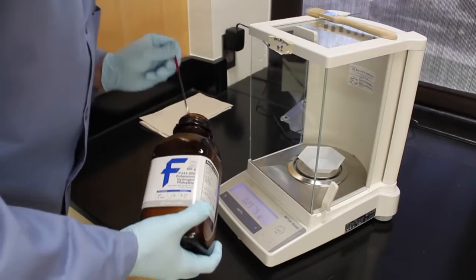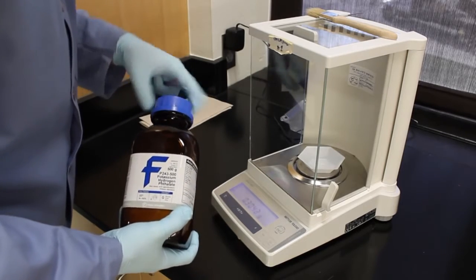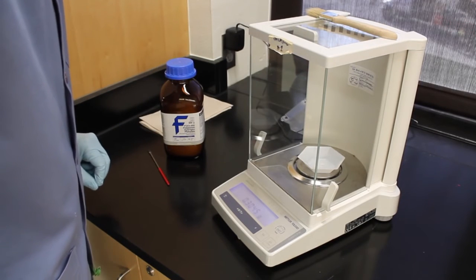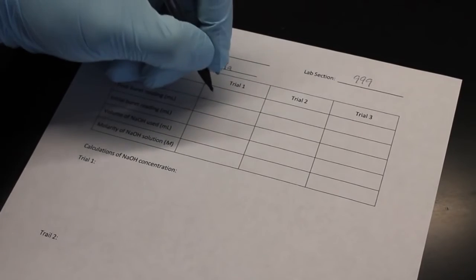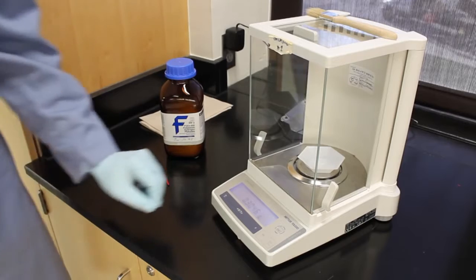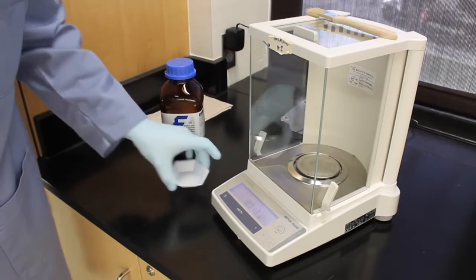Any excess KHP should not be put back into the bottle, but disposed of properly. Ask your TA for specific instructions. If you are using this style of balance, make sure to slide the door closed to get your final mass. You will need to document your KHP masses each time you take one. I recommend you weigh out 4 separate boats of KHP for your titrations, but really it's up to you how many you do. Make sure the balance is clean when you are done with it.